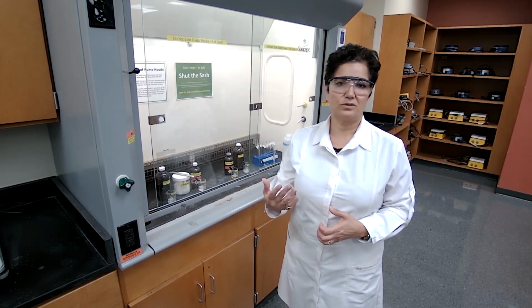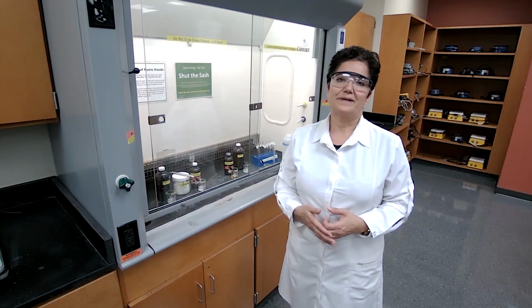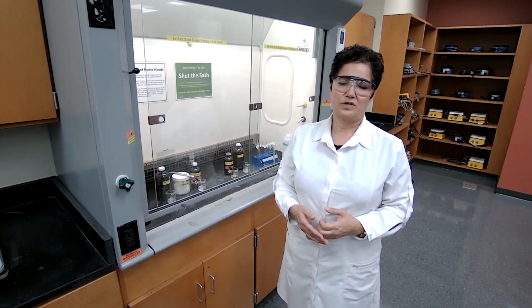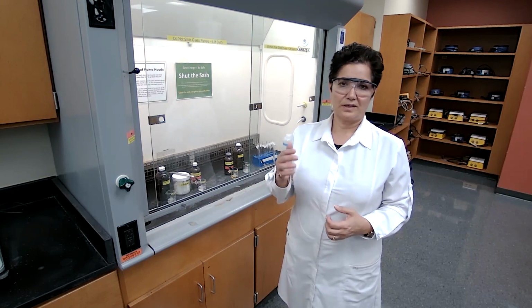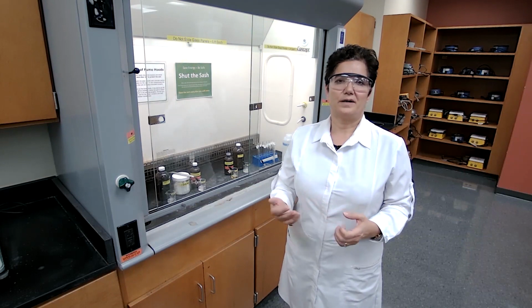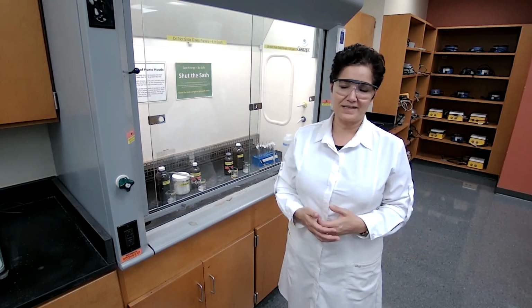You can do a spectroscopy technique, and for IR spectroscopy, based on the location of the peak, you would determine the functional group. But in the organic lab, we are not going to depend only on the IR because not every lab has the IR machine. So we are going to determine the functional group using solubility tests and classification tests.